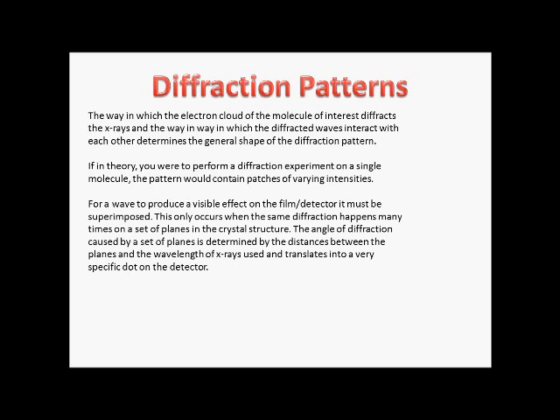If the same part of the same molecule is diffracting waves in the same way on two parallel planes, then there could be constructive interference between the waves produced, which would amplify their effect and make them visible on the X-ray diffraction pattern, if the effect was repeated along the whole lattice.